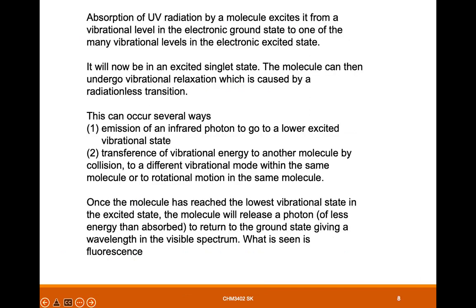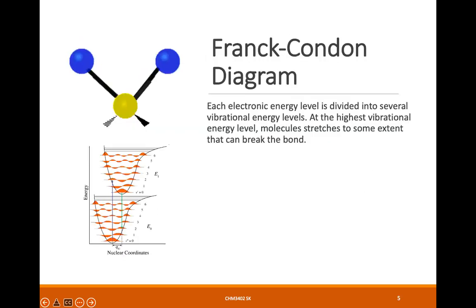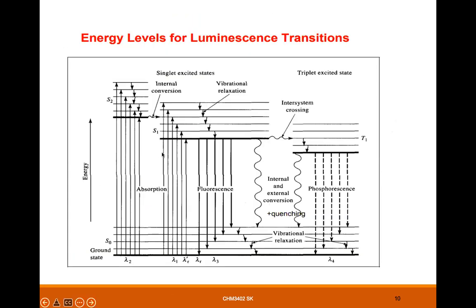This is the ground electronic state, and this is the electronic excited state. S1 represents electronic excited state 1, and then S2 represents electronic excited state 2.